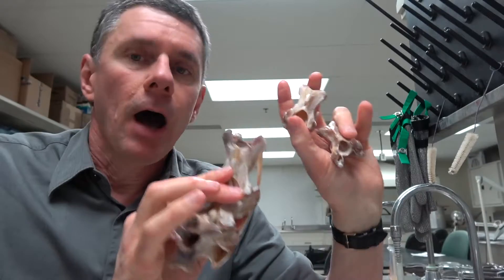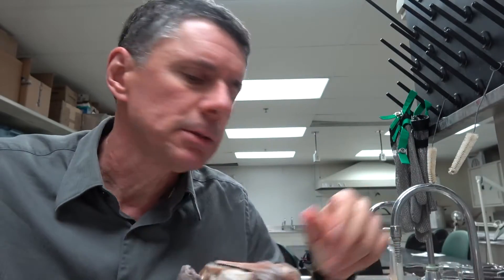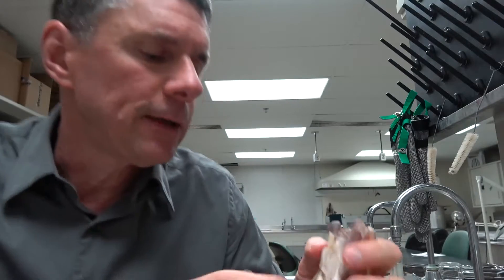Hi, I'm Larry Whitmer bringing you another Random Active Anatomy. Today I'm in the preparation lab working on finishing up the preparation of an ostrich head and neck. Actually the head is still in with the Dermestid beetles, but the neck was ready for me to finish it up.